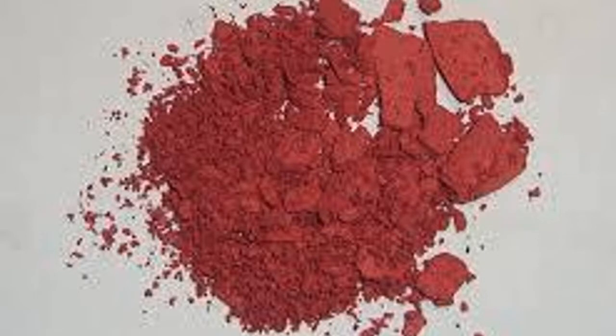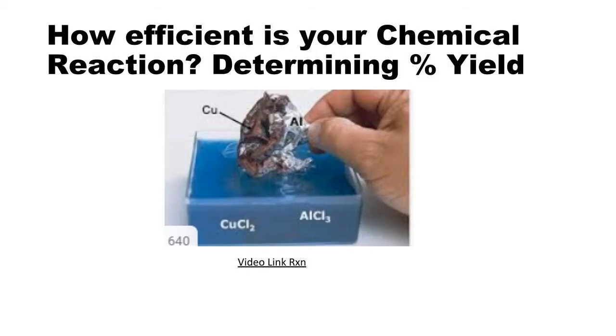All right, people, here we are. Time has passed, and we have collected our sample. What you'll see is that we have this orangey reddish kind of substance that has been collected onto our filter paper. Our numbers are 1.17 grams on the scale with the filter paper and the copper.